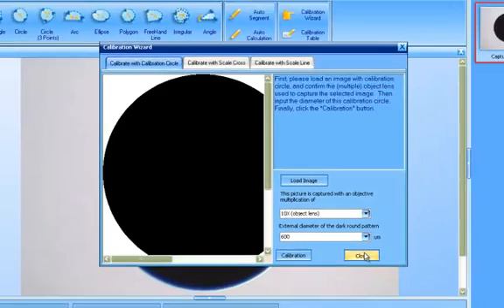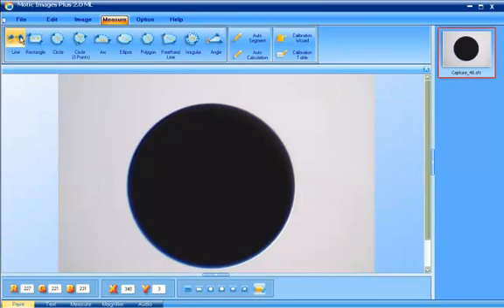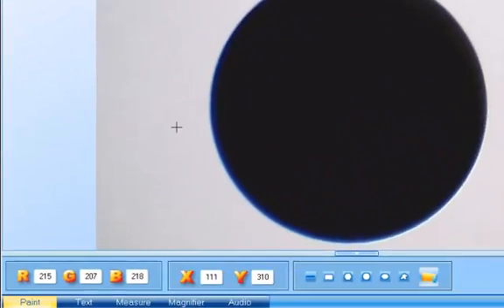Now that you've finished the calibration, just click on close. Now let's see if it was accurate. To use a measurement, click on the measurement tab and select line measurement.